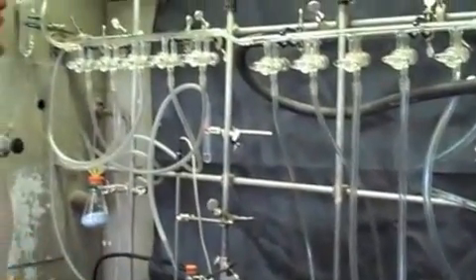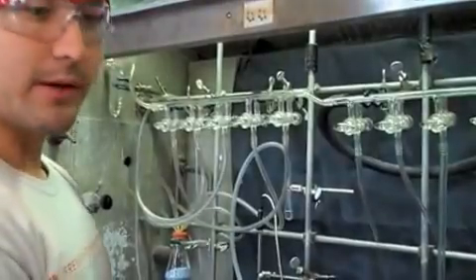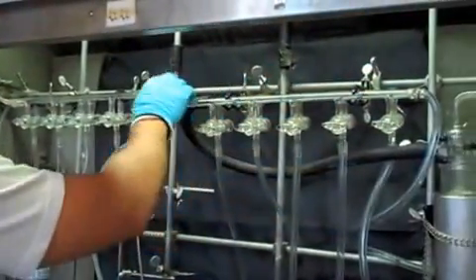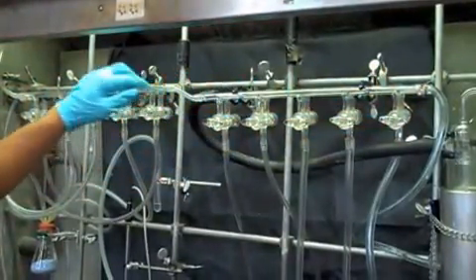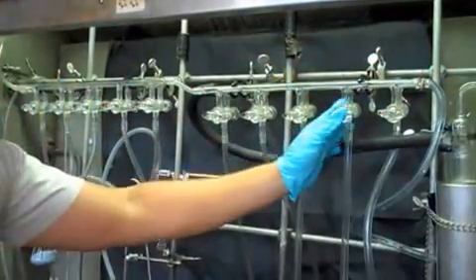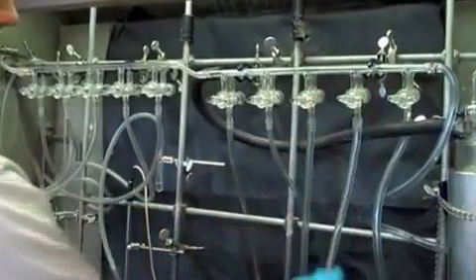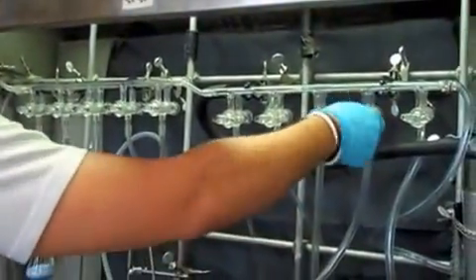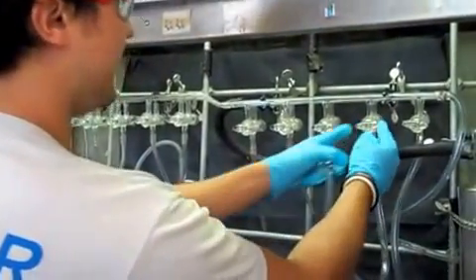So before the titration, we thought we should do a quick rundown of how the manifold works. You saw the N2 tank, the line will come in to this part of the manifold, and it goes all the way through these front lines. Now, there's also a vacuum that goes through the back manifold, and they're connected by this joint right here, and you can actually switch each line from vacuum to nitrogen at will with these little stopcocks.